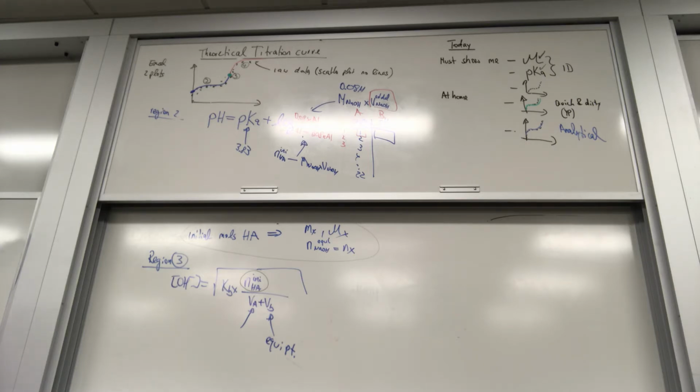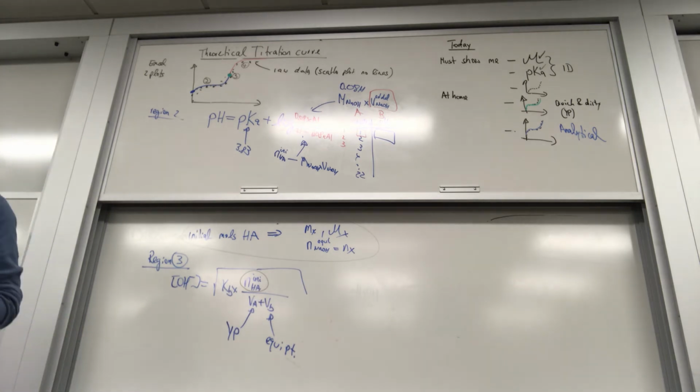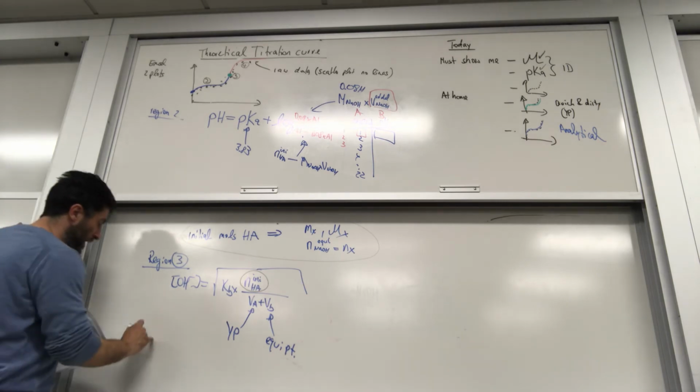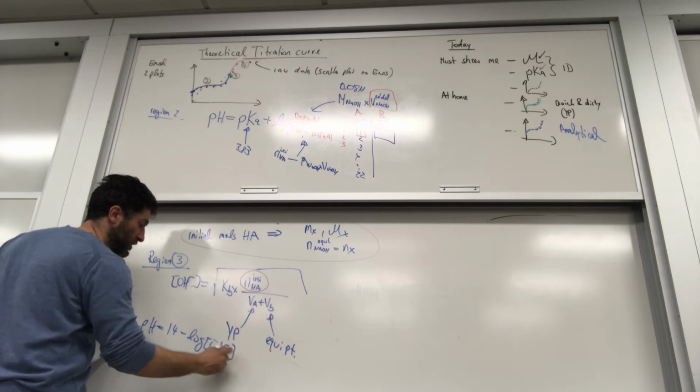Remember I told you guys to weigh out with a graduated cylinder how much water you put in. I said it doesn't matter if it's 150 or 250 milliliters or 50. Just weigh out with your graduated cylinder how much water you dissolved your sample of acid in. So you need to go to your yellow pages and look at how much DI water you added to your sample X. And then pH is basically 14 minus log of OH minus concentration.